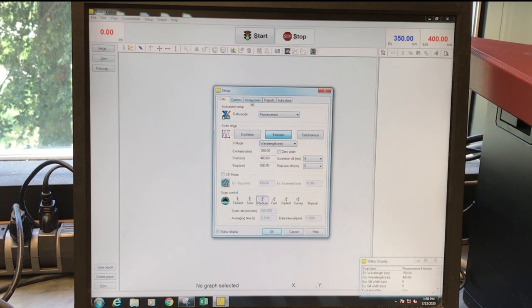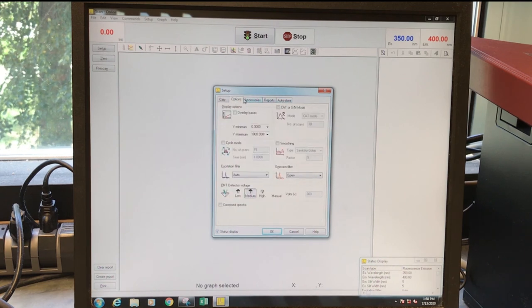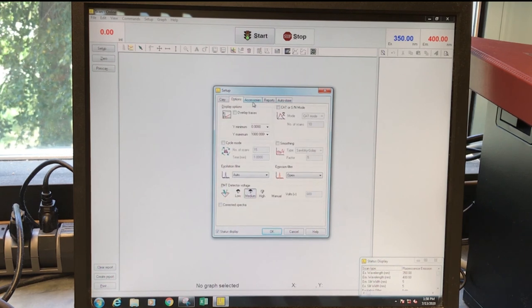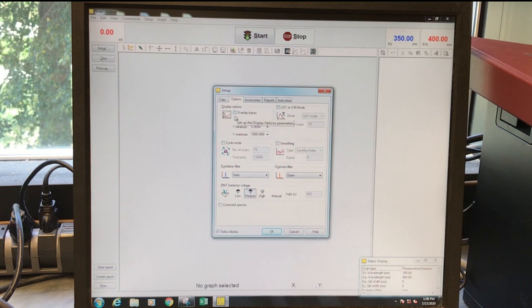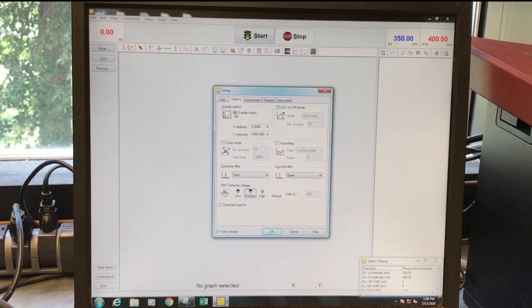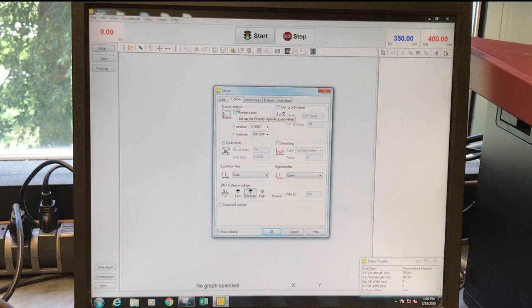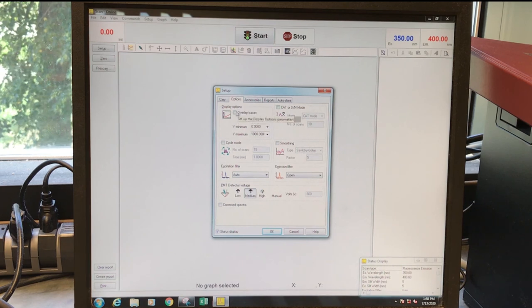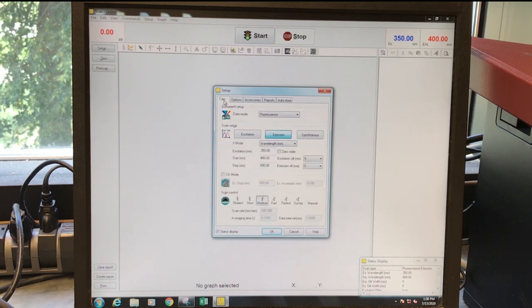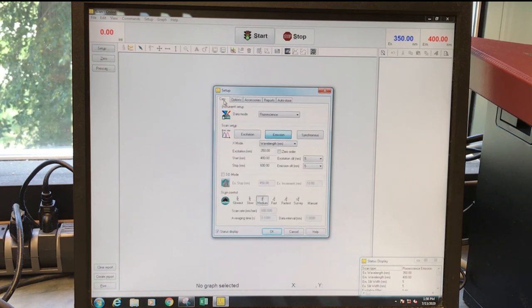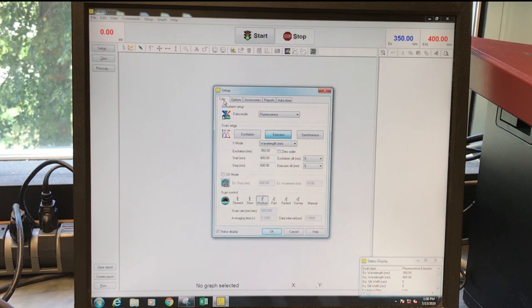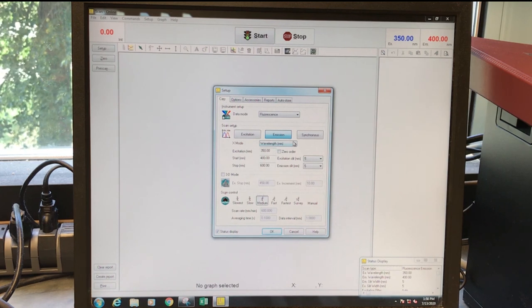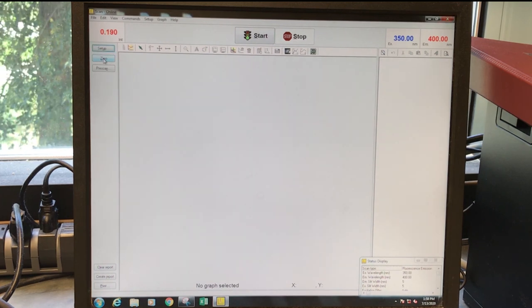These other things typically don't change too much. You may want to think about overlaying your spectra on top of each other. The way that this operates when this isn't checked is that there will be different windows that pop up for each spectrum. And that's fine. So that's our setup.